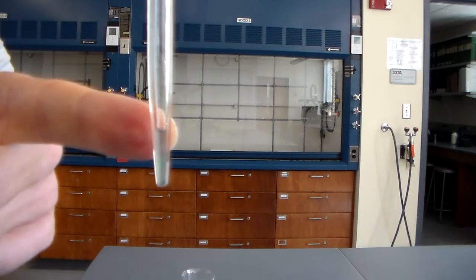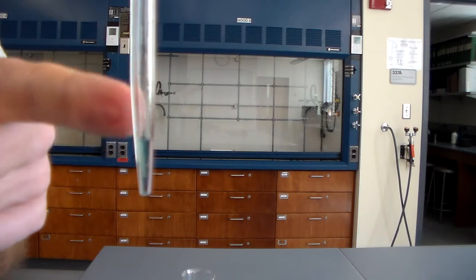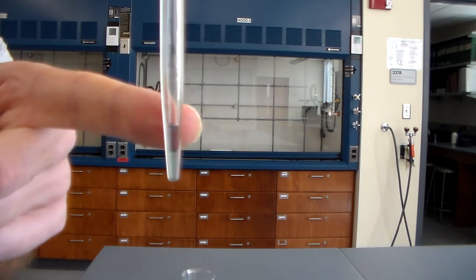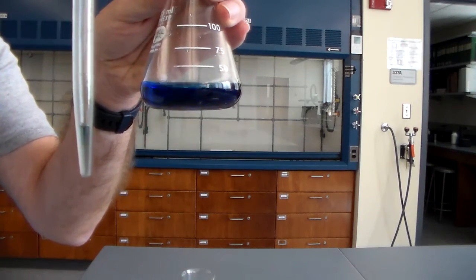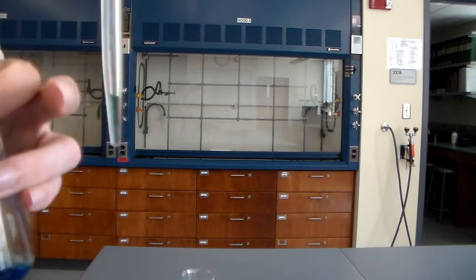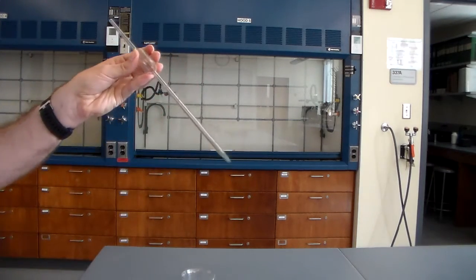The reason is that these pipettes are designed to deliver, meaning that they're designed to leave that little bit of liquid left in there and not have it being blown out. So even though it's very tempting, please make sure that you do not blow that out and put it into there, because right now this contains 25.00 milliliters of liquid. If you add that little bit extra, it's going to be over, and we simply just don't know how much it will be by.